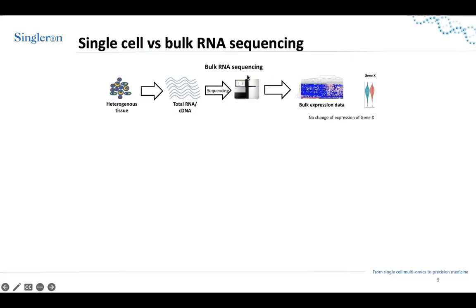So at this stage, here we have the fastq files. From here to here, we do the pre-processing. I don't show the individual steps here. We get here the count matrix. I will talk about what it really means. And it's only after we get the count matrix that we can start to do the downstream analysis. And of course, for the bulk RNA-seq, we don't really call it a count matrix because it's just too small to be called a count matrix.